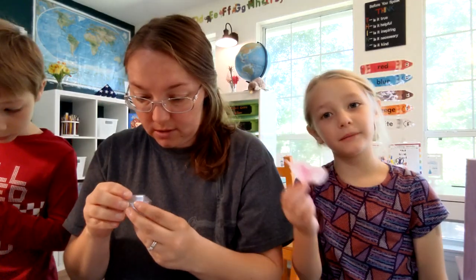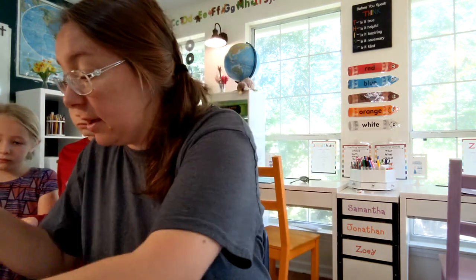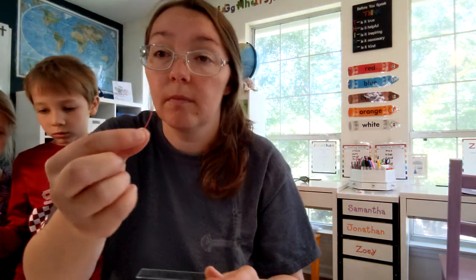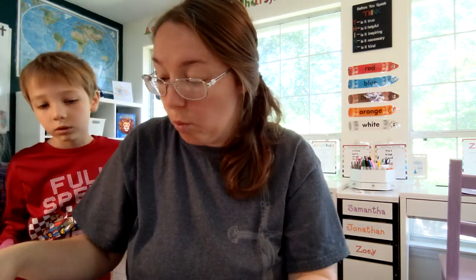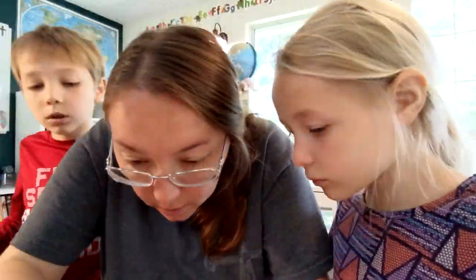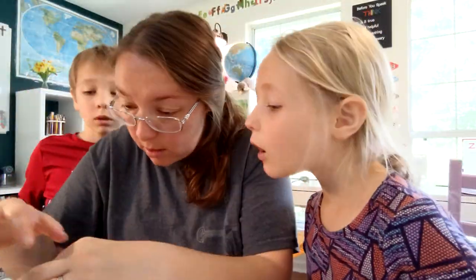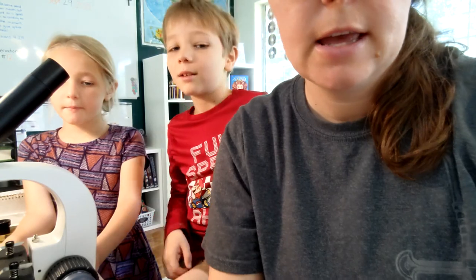So we are going to be using distilled water — I have a little bit in here. It says to take a stamen. You need to take one stamen out of your flower. We are going to put it right in the middle, and then it says to take one drop of distilled water. Now we'll put all of these under the microscope.